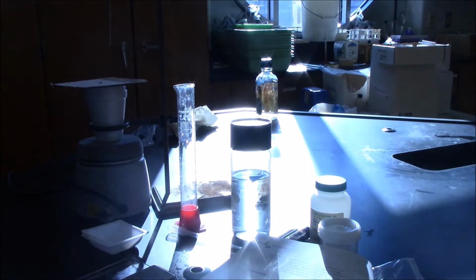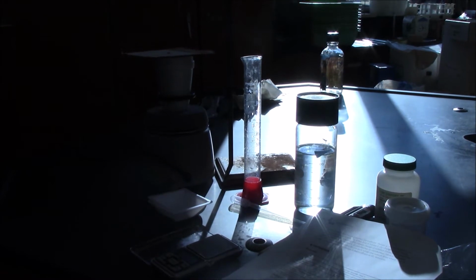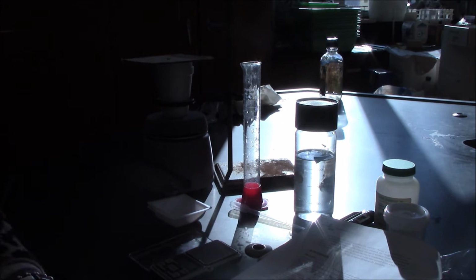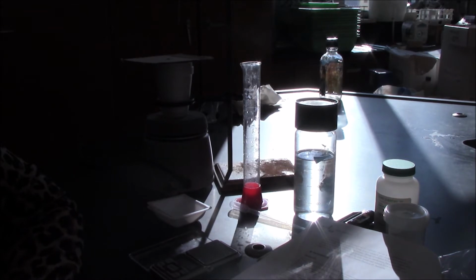So in this lab, we have a practice part, and then we have an application part. In the practice part, what we're going to be doing is dissolving a solid in water. That solid is anhydrous magnesium sulfate, and we're measuring a temperature change. Really the whole purpose of that is to practice for when we have to do this and we care about our data in the inquiry portion.